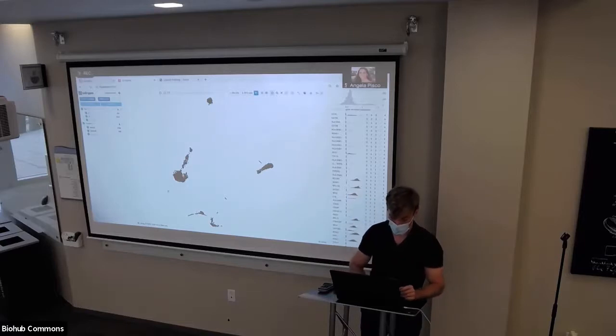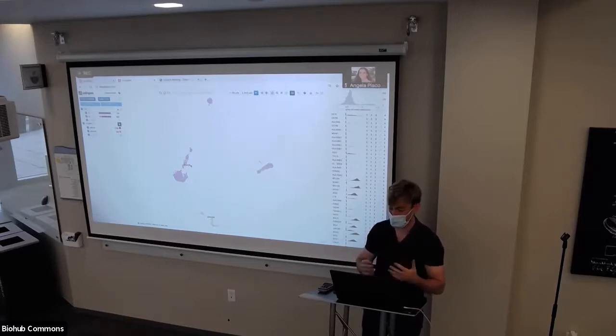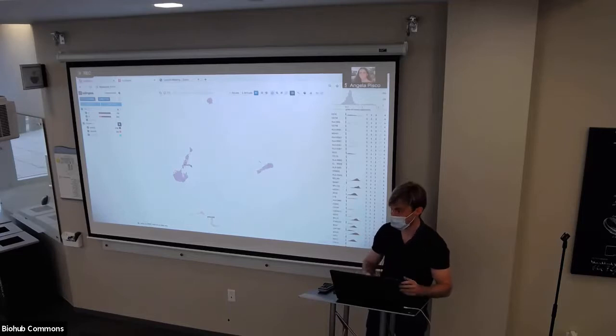And the last thing I want to show is a button at the top right, at the top of the menu bar. When a category is colored by, show labels on the graph. So this is going to calculate the centroid of each category. Here it's a little bit less sensical because we're coloring by batch and not by like clusters. But you can see that it overlays a label.